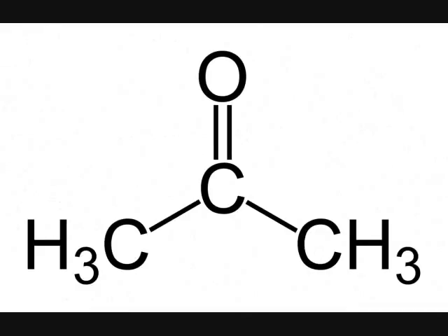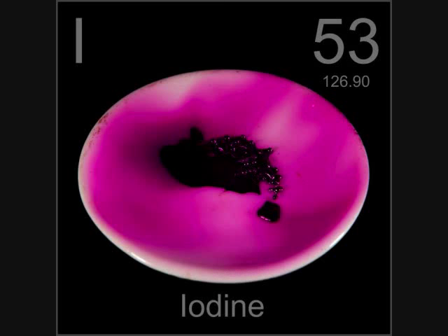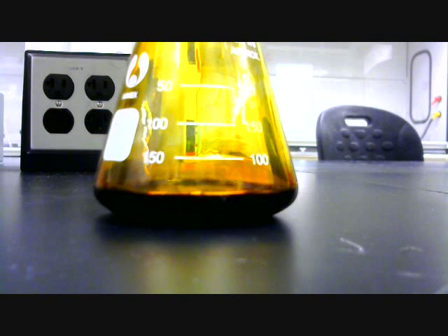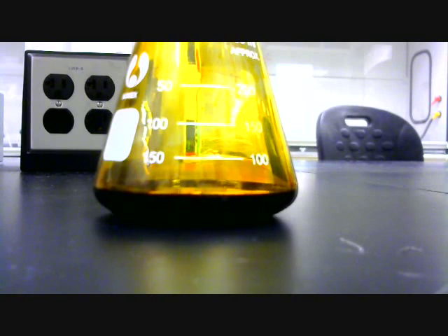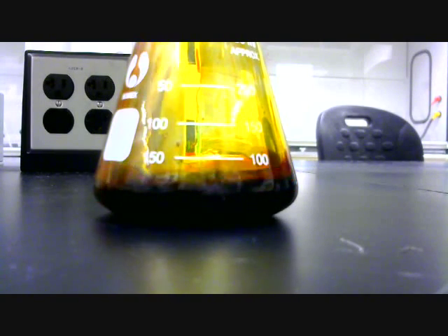The methylketone used in this reaction is acetone, found in nail polish remover. Because it's slightly less nasty than the other halogens, I used iodine in this reaction. Here you see a concentrated solution of iodine and acetone, which gives it the brown color.